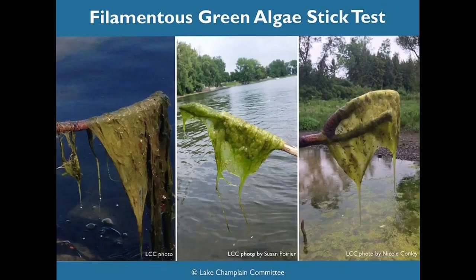Use a stick to attempt to lift the algae from the water. If the algae lifts from the water and has a stringy, cottony consistency, it is likely filamentous green algae. If you cannot lift the algae, it clouds the water, or it disperses into particles, it is likely blue-green algae.